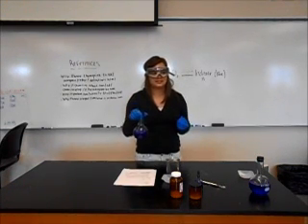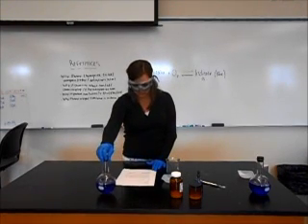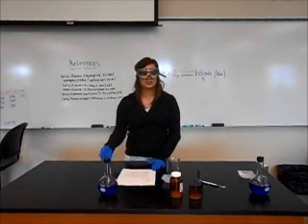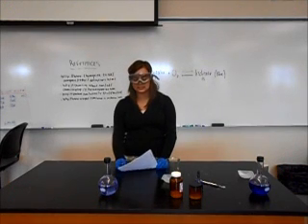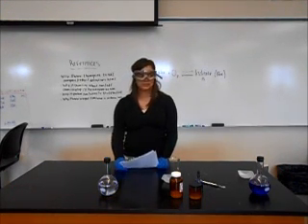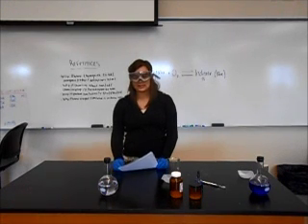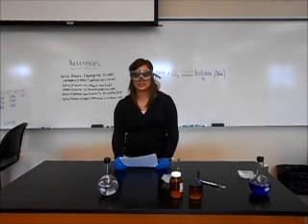And then you can do this as many times as you want until all the oxygen in the flask is used up. After it settles, you can shake it again. And the reason that this happens is that by shaking the flask, you reintroduce oxygen into the solution, so that causes the methylene indicator to turn blue. And then when you let it sit, the dextrose reduces the oxygen in the solution, so it causes it to turn colorless again.